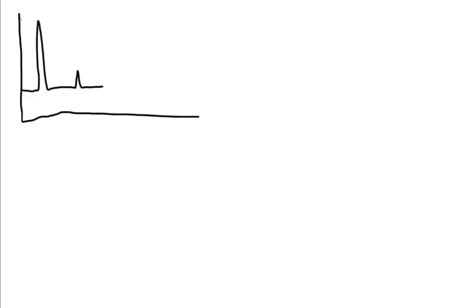Okay, folks, so we need to talk about how to process data from my gas chromatography system. So this is after my sample has already run through the machine and I get my big fancy chromatogram that comes out in the very end. So I see a flat line and then a peak comes up and then back down and then another one and then another one, and let's say this is just a three-component system.